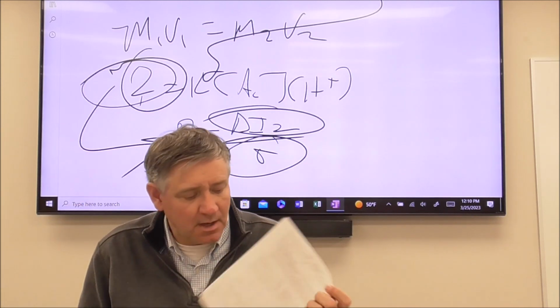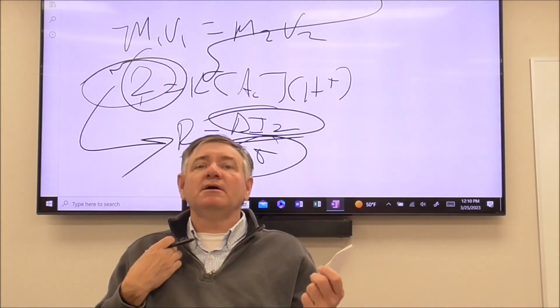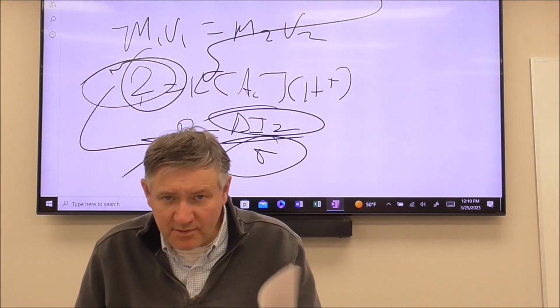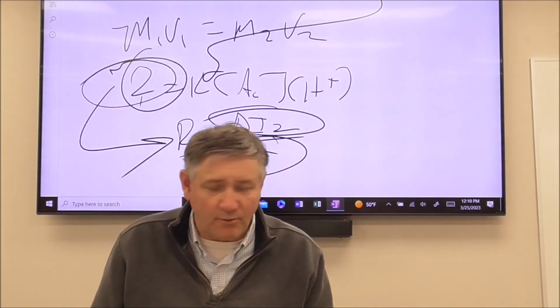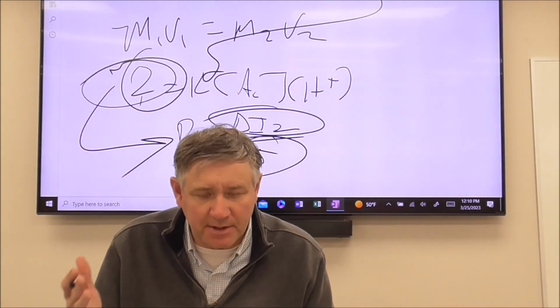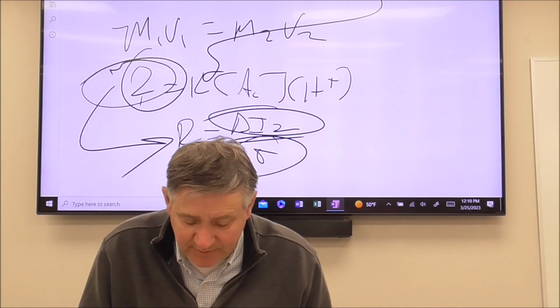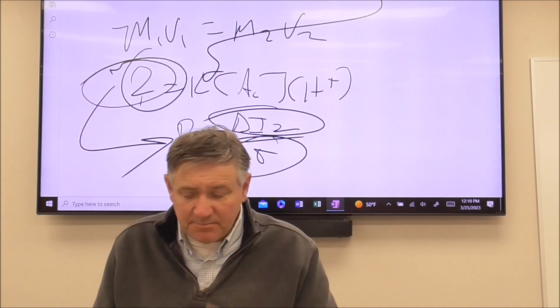There you go. Okay, now we're going to determine the activation energy. You're going to choose one of the reaction mixtures. I don't care which one, 1, 2, 3, or 4. You're going to pick one. And now we're going to look at what's going to happen in terms of an influence of temperature. So this is important in terms of the technique.